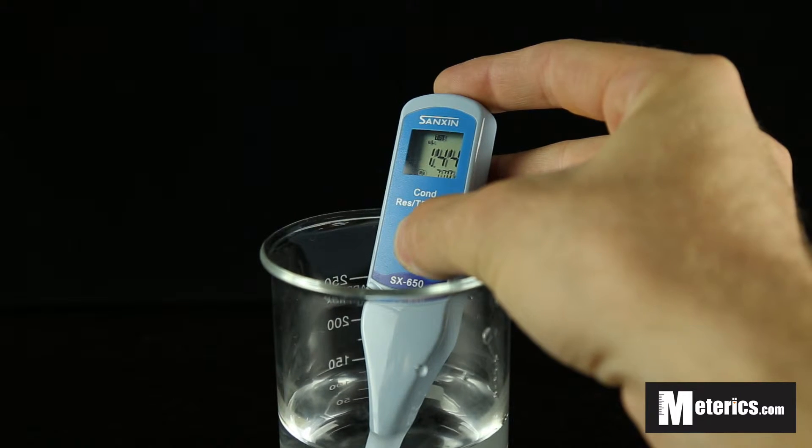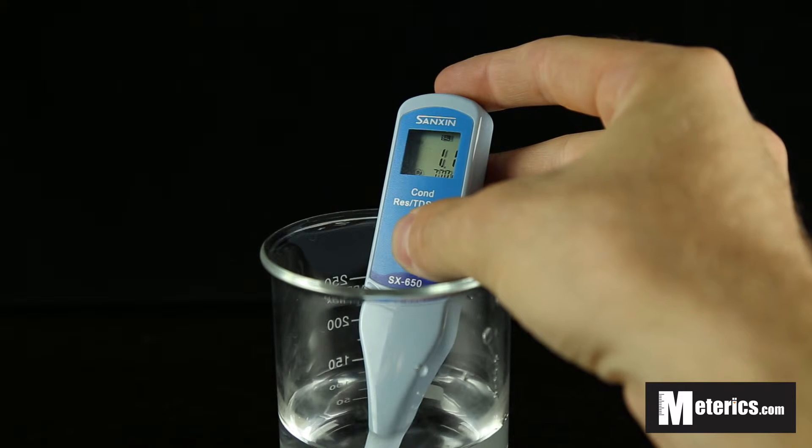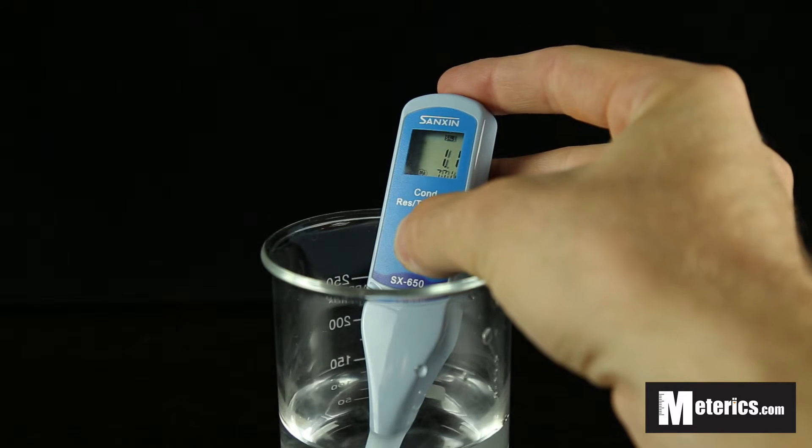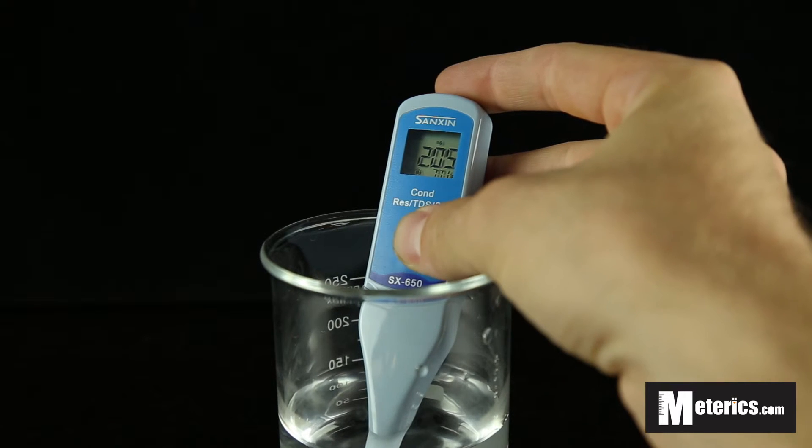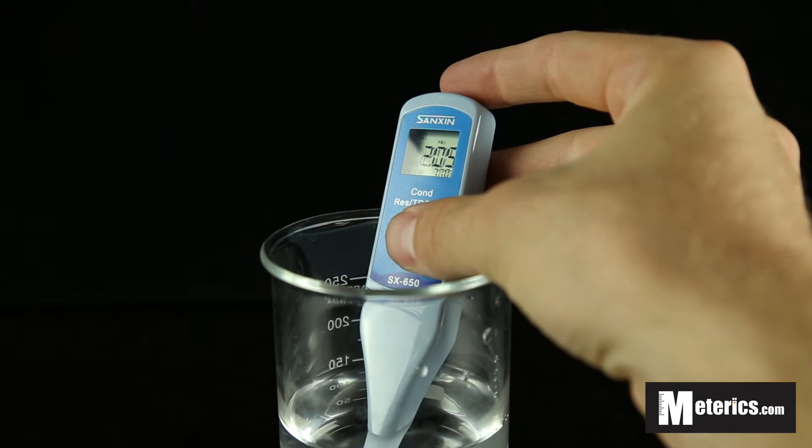You hold that down again and it switches to salinity. Hold it down once more and you're back to conductivity.